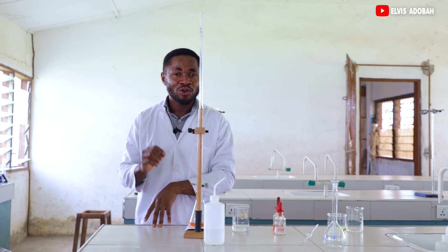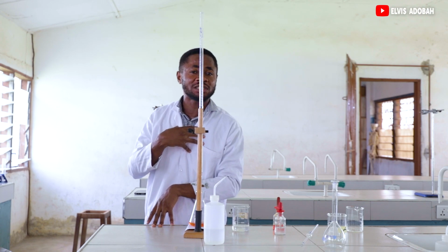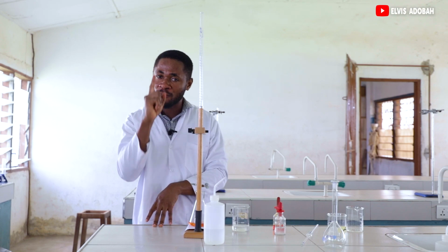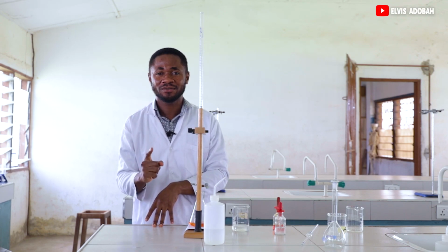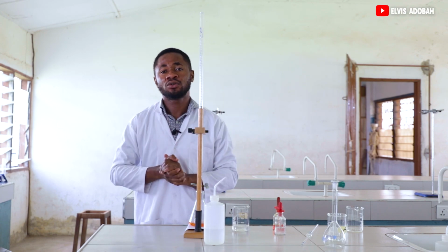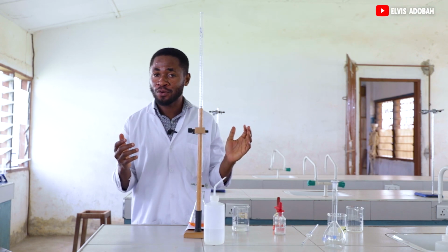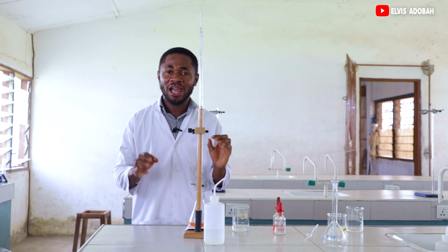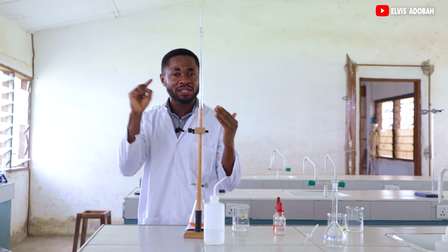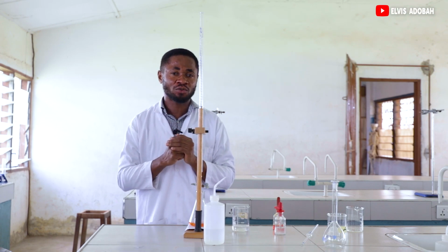Remember I told you, you will be marked based on what your teacher gets from his personal titration. Now, he's not supposed to disclose that value to you. But if you perform your titration very well, the right way, you are going to get within your teacher's values. And how do you perform it very well? The first titration I've told you is called the rough titration. It gives you a fair idea where the endpoint is hovering around. But in the second titration, don't get it wrong.